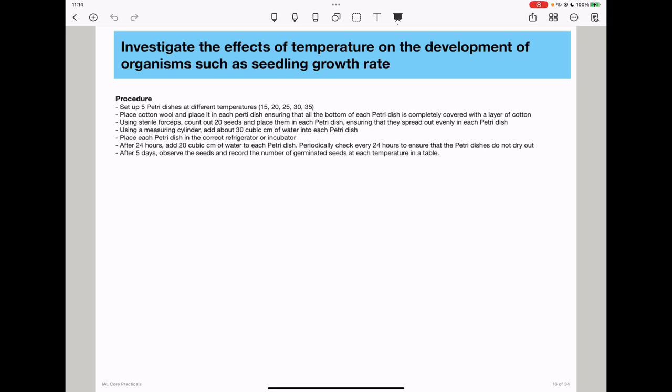Place each petri dish into the correct refrigerator or incubator, and after 24 hours, add 20 centimeters cubed of water to each petri dish. Then periodically check every 24 hours to ensure the petri dishes do not dry out. After five days, observe the seeds and record the number of germinated seeds at each temperature.